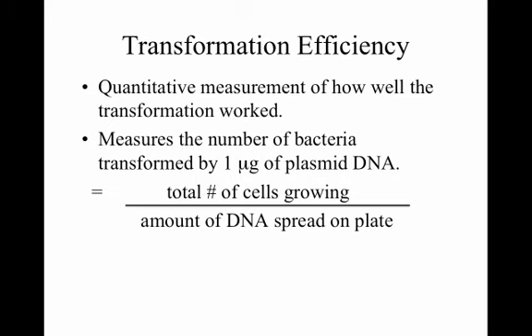And so when scientists do experiments, that's one of the things that they try to adjust to get the best transformation efficiency. And after you get your data back from this lab, that is one of the calculations that you'll be doing. But we'll go into the details of how to do that a little bit later. So for now, just know what transformation efficiency is, but don't worry about the math behind it. In a later lecture, we'll talk about that.